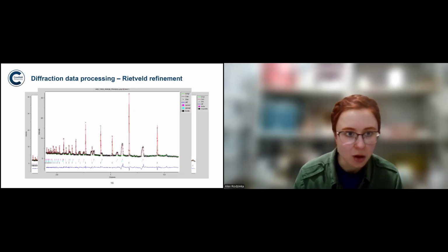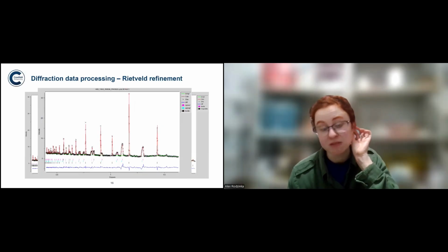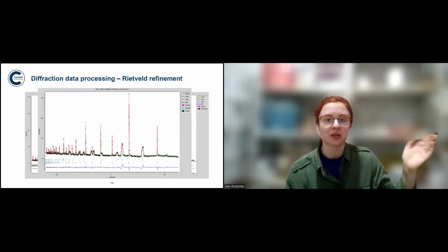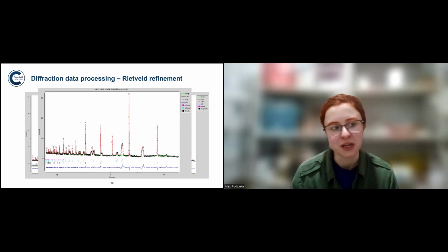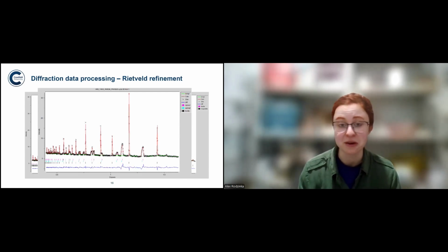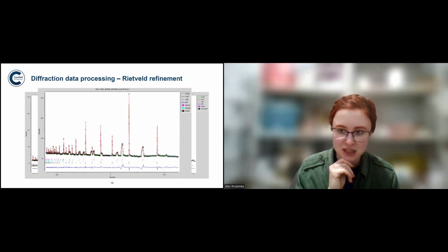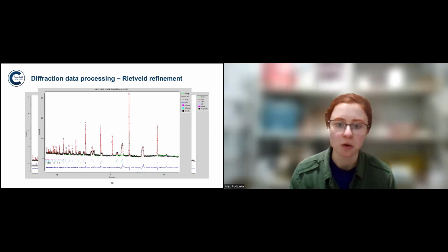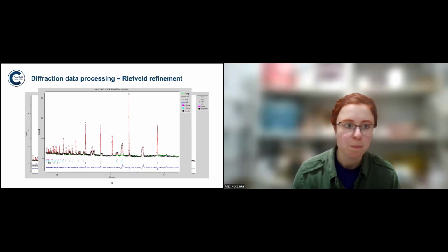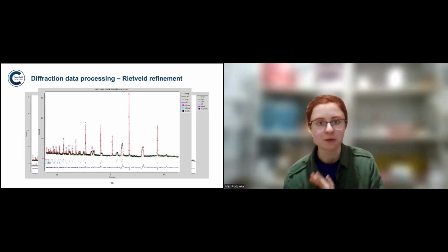And this is an example of a neutron diffraction of a bimetallic sword. So one of the swords that you saw earlier, it had iron inside. And to me, it's completely inconceivable that you could analyze that iron without any sampling, but you can with neutrons. So what you're seeing here, you're still seeing those peaks for ferrite, those very thin, long, narrow peaks, because that's what we focused on. But you're also seeing those wider peaks, which are the bronze that surrounds it.